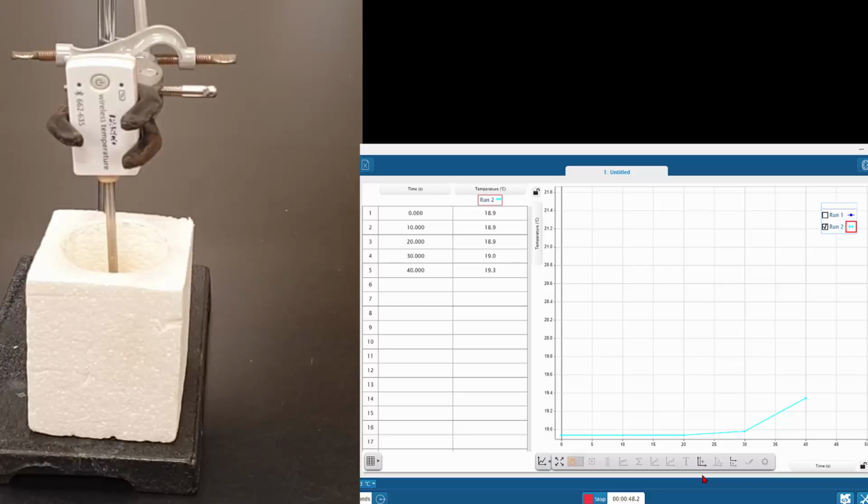All right, now this takes 20 minutes. And so I'm going to have to jump around a bit because I'm not going to show the whole 20 minutes.